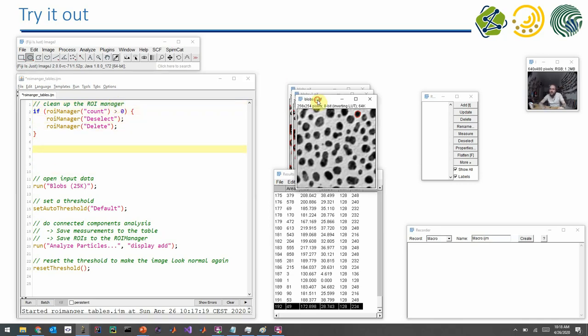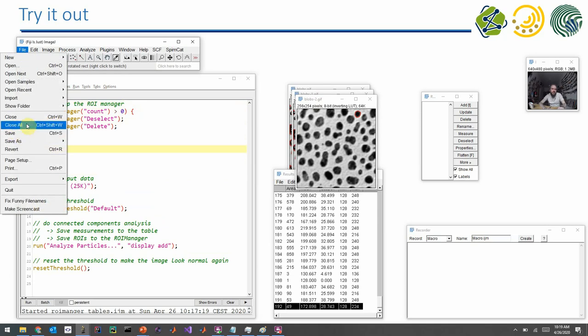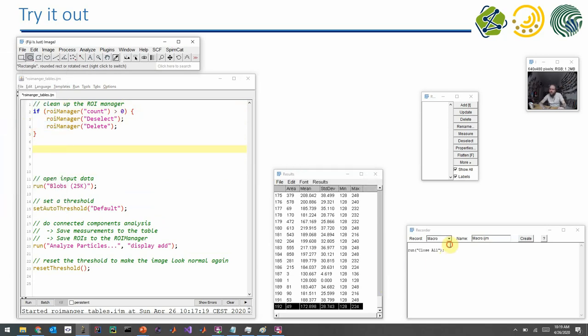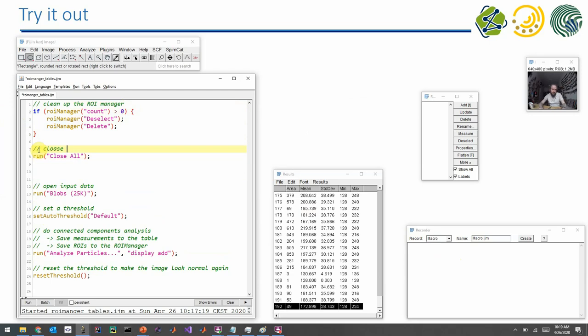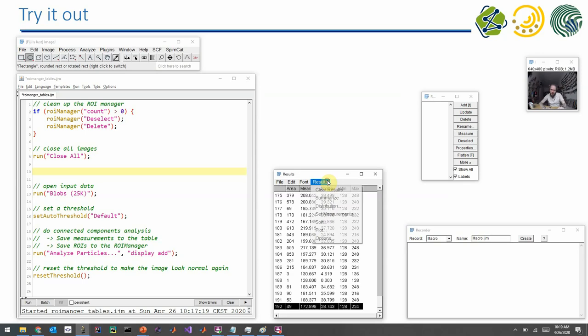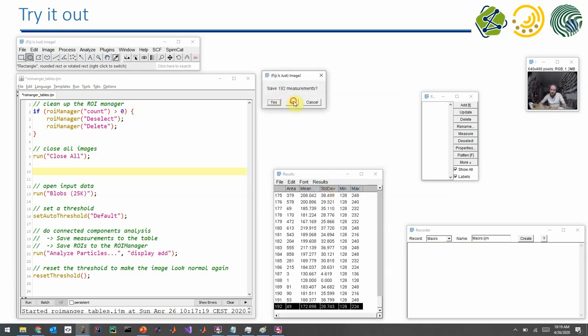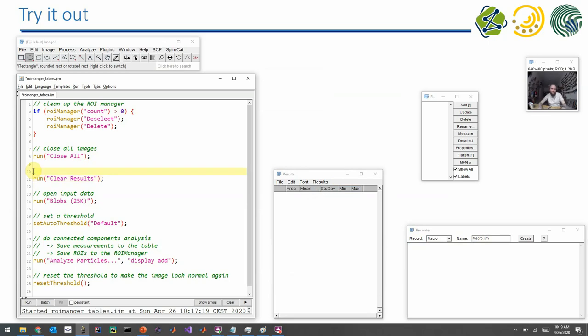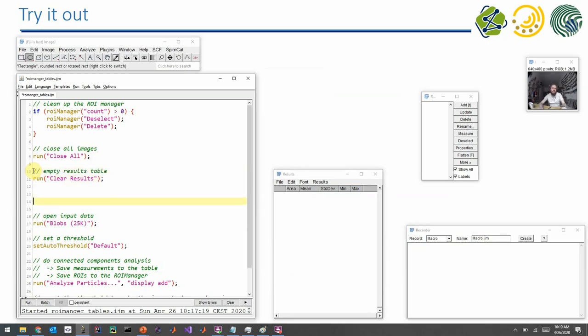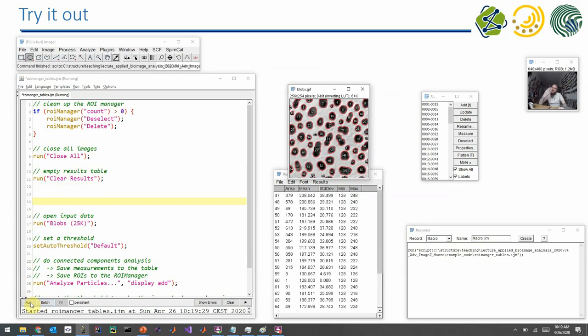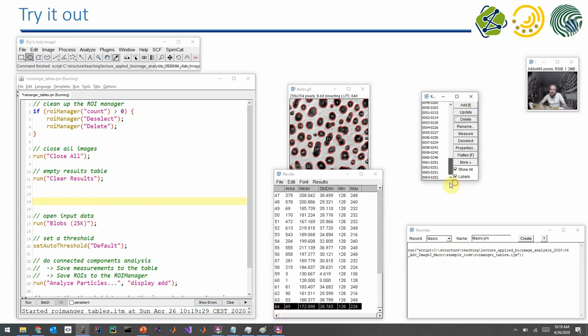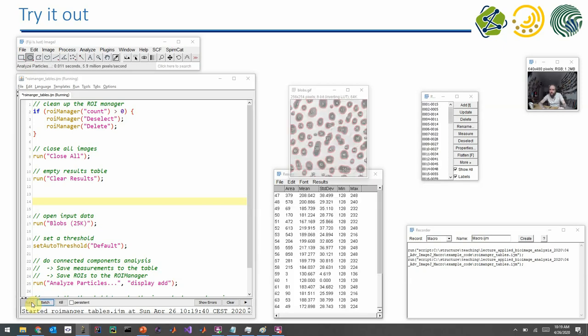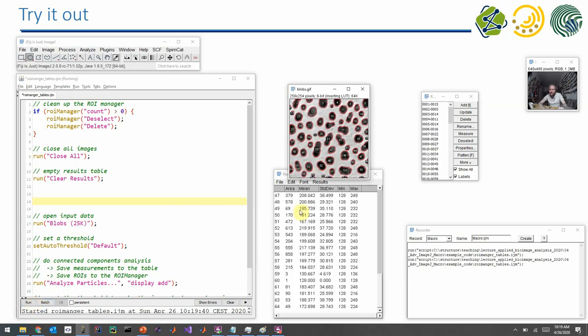So we don't do this if the ROI manager is empty, right? And furthermore, there is a command for closing all images which is called close all. So you can also see this one. And furthermore, if you want to empty the results table, there is also a command for this. And if we execute this program now, we see we have these 64 entries here in our results table. We also have 64 entries here in the ROI manager. And if I execute the program again, it will still be the same. So the starting point is again and again the same. That's super important for reproducibility, right?